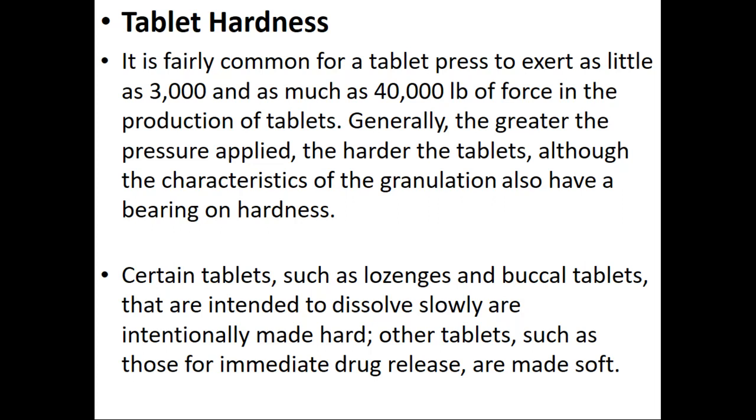Certain tablets such as lozenges and buccal tablets that are intended to dissolve slowly are intentionally made hard.